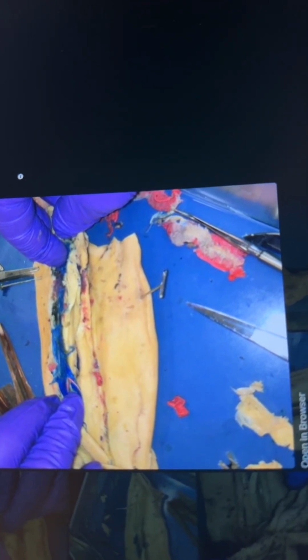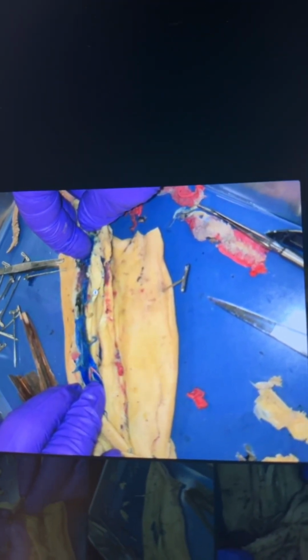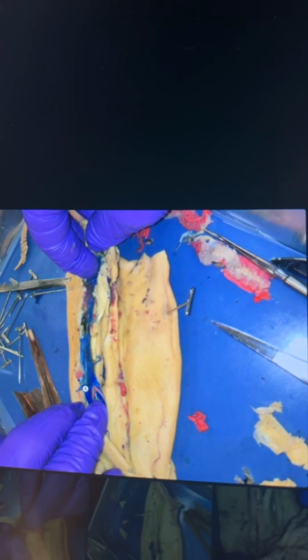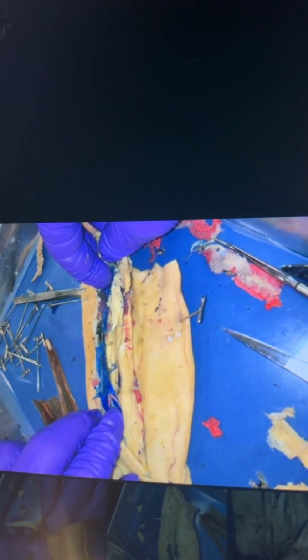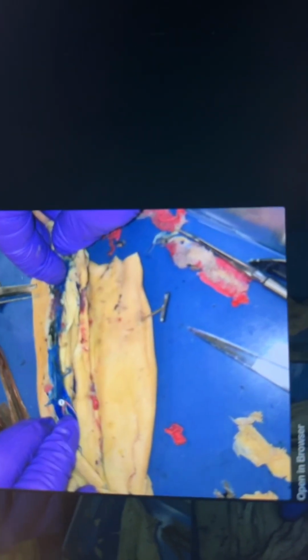So the big difference here is that the squid is going to be super predatory, so it's going to need a closed circulatory system to provide the blood pressure necessary for the aggressive movements that it's going to do. It actually has 3 hearts, and the hearts are going to sit up here where this blue area is. It's going to have a central heart. This is the systemic heart that's pumping hemolymph to the body, and then it's going to have 2 branchial hearts that sit about right here and right here. And you can actually see the gill here. This part down here attaches up into this branchial heart, and these hearts are pumping blood to the gills, and that's for insurance of efficient oxygen transport because of the fact that they're so predatory.